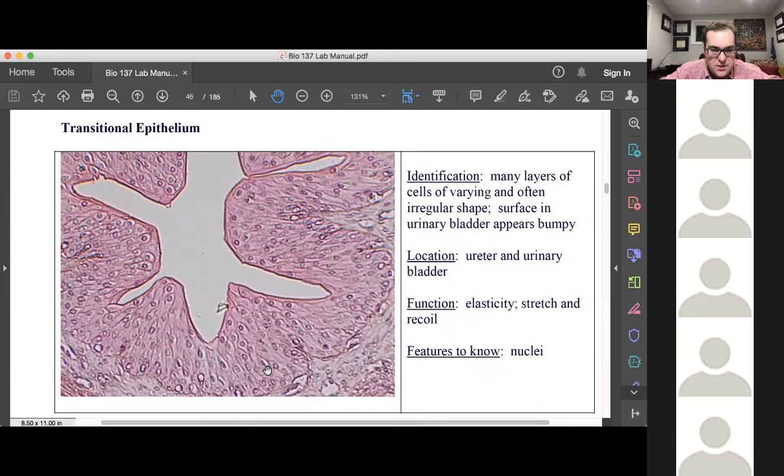This is something that pops out in your urine sometimes. If you were to submit a urine sample and you may have a UTI, if I see a bunch of transitional epithelial cells, this tells me that you have an upper urinary tract infection. These are kind of interesting. That's probably about the only clinical indication they have, because when you are under a bacterial infection, these will slough off and fall into the urine.